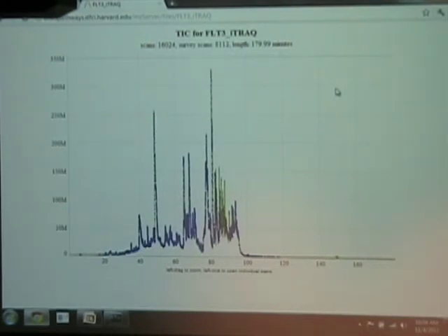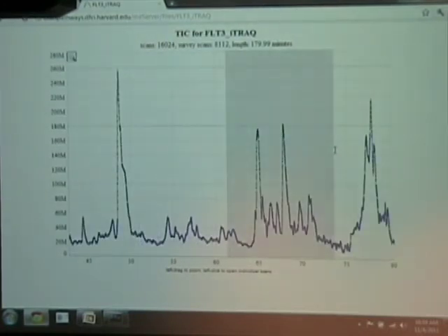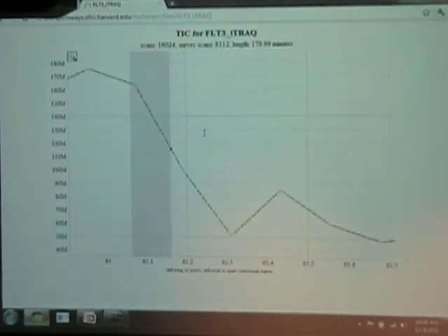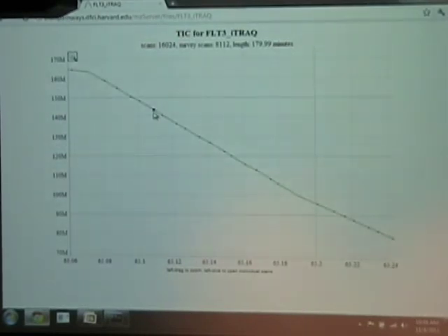If you go up one more level, what you'd expect to happen is that this will cause the raw file to be downloaded. This is what you want. And right now, what it does is it makes a total ion chromatogram. The reason is, if we made that possible, people would start downloading raw data from our demo server, and the bandwidth would be problematic. But this is also kind of sweet in that you can basically look at the entirety of the file and click to go to any of the MSMSs. Right? This is the file we were seeing earlier.